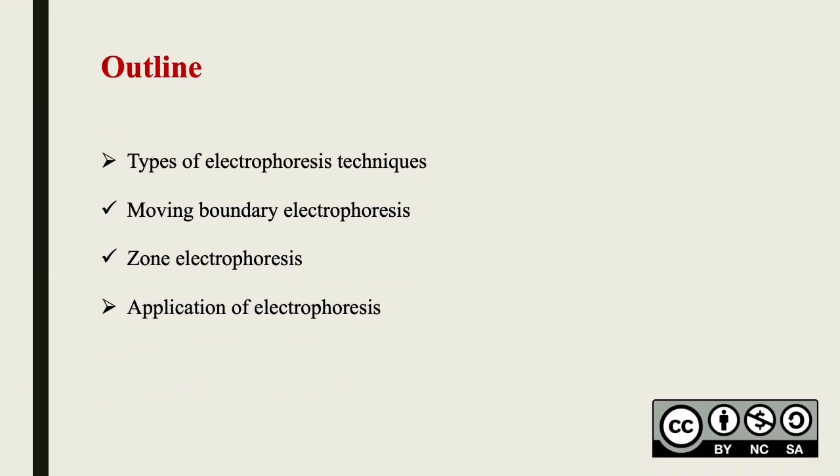Here is the outline. In this class I am going to cover the types of electrophoresis techniques, which are the following two: moving boundary electrophoresis and zone electrophoresis. Followed by that, I will cover the applications of electrophoresis. So let us start with the electrophoresis technique.